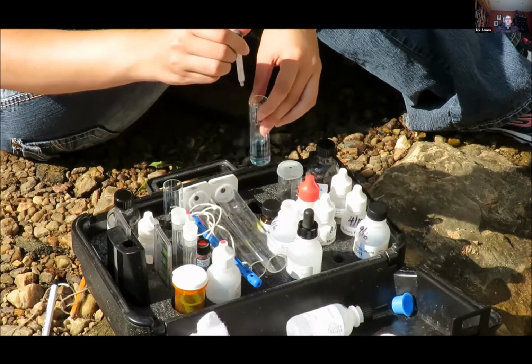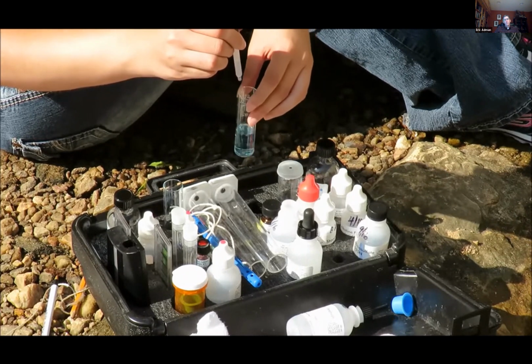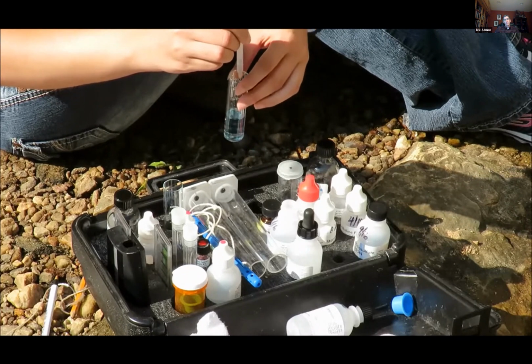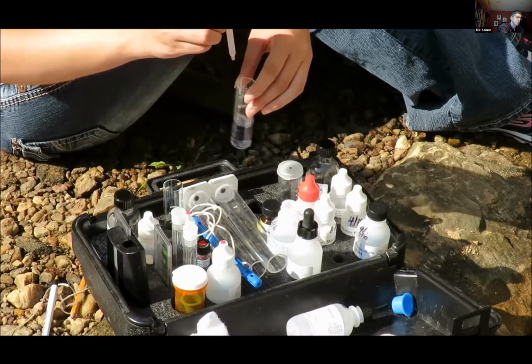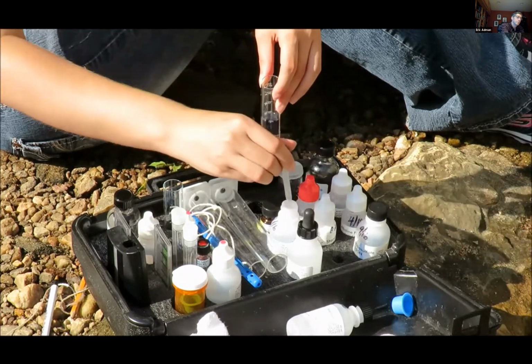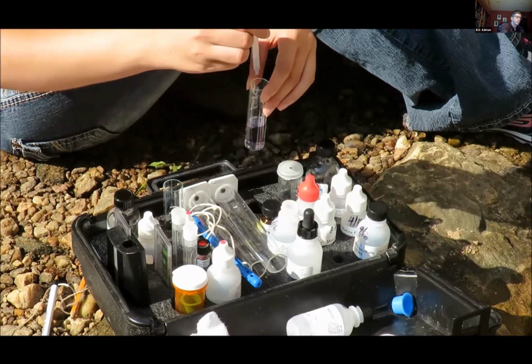Continue adding single drops of the reagent until the blue-green color changes to pink and eventually no longer changes with any addition. Do not count the last drop when there is no color change after its addition. Refill the dropper when needed to ensure uniform size drops.